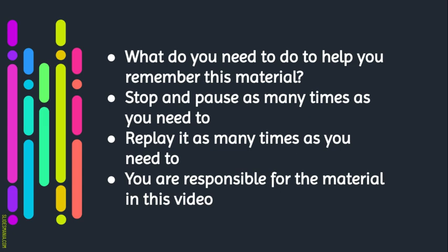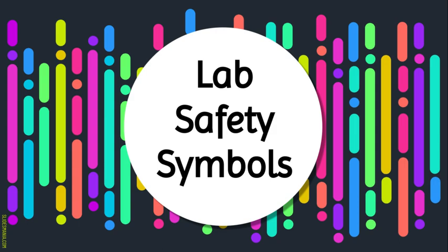You need to figure out what is the best way for you to remember this information because you are responsible for it. So let's talk lab safety symbols.